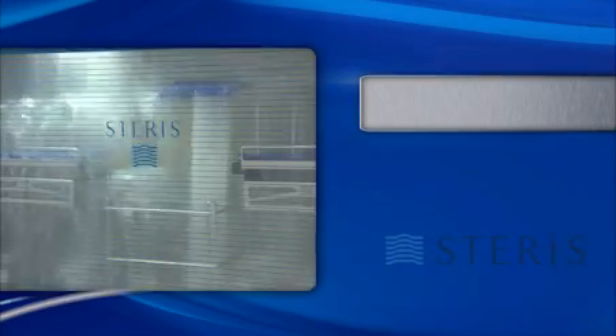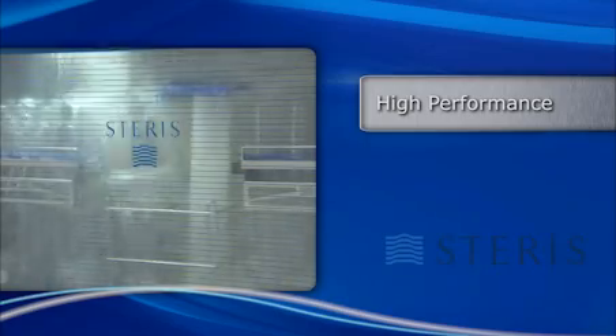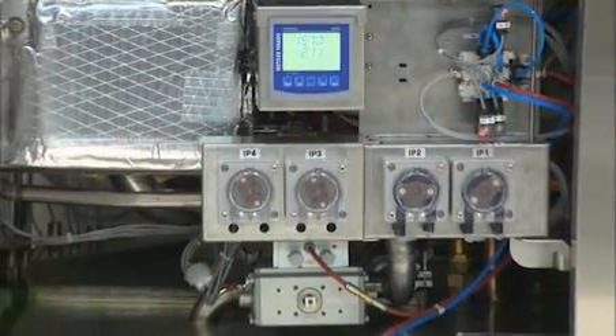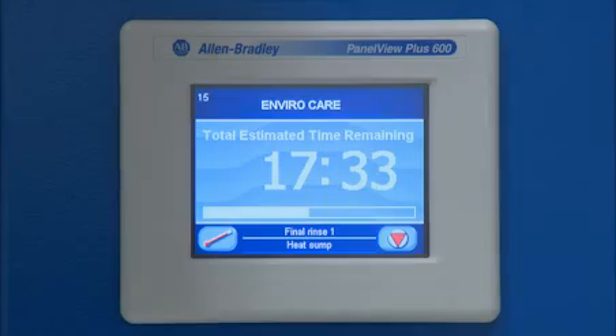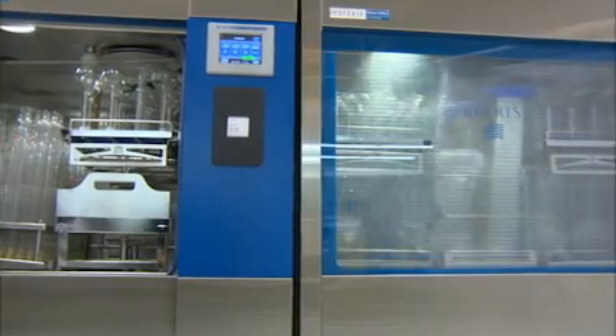The XLS series of washers are designed for high performance and ease of qualification. As an example, the optional process monitoring package includes systems that monitor chemical concentration during wash phases. Final rinse water conductivity can also be measured to ensure thorough rinsing is achieved prior to the drying process.